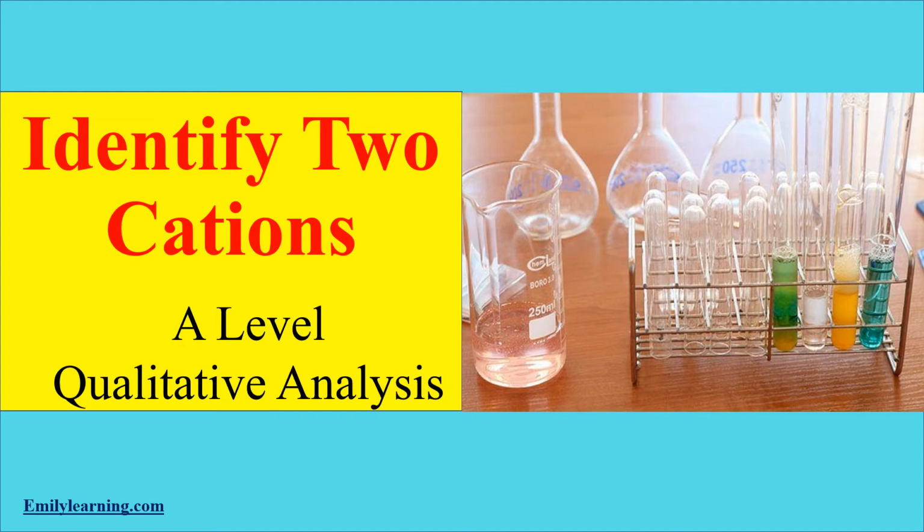In this video, we'll be talking about a type of question in A-level chemistry practical, and that is the qualitative analysis questions involving identifying two cations in an unknown solution or solid. So let's get started.